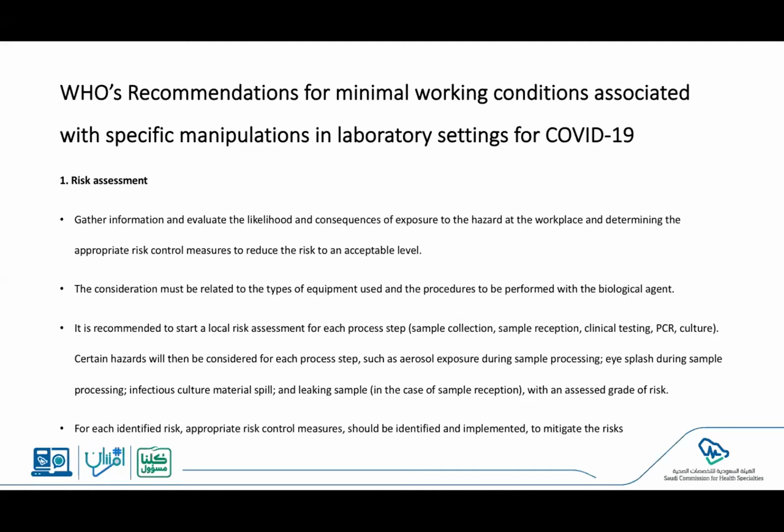Why is that? Because then you can anticipate the risk associated with each procedure. So you can identify the appropriate control measures to mitigate any associated risk. So let's go for example. If you are working in sample processing, for example, or sample reception, then you need to consider exposure to aerosols, through, for example, eye splash, or spills, or leakage, and all of those potential hazards can actually be considered, and then you will need to identify the appropriate methods to mitigate.